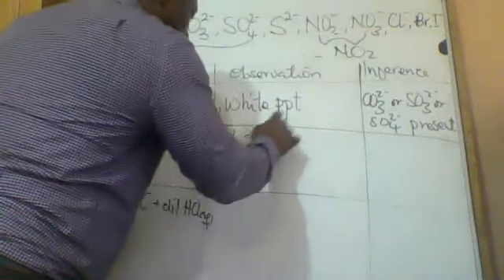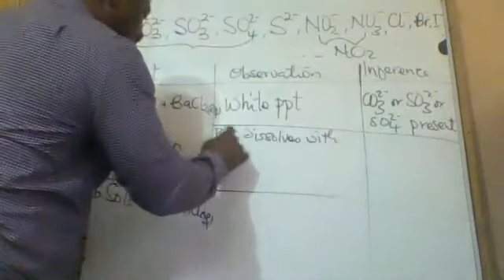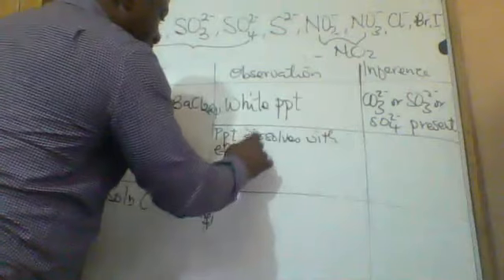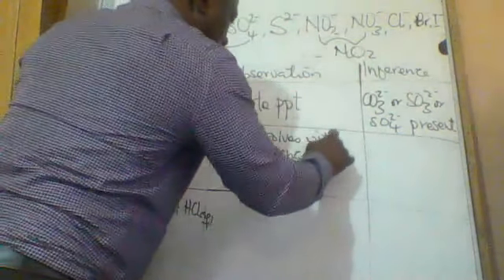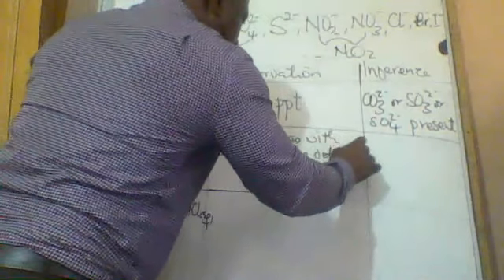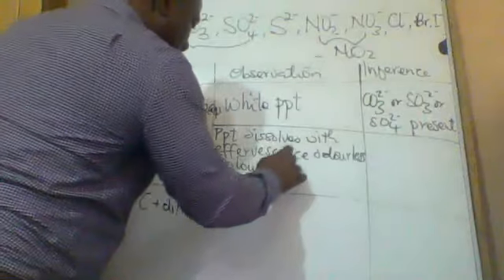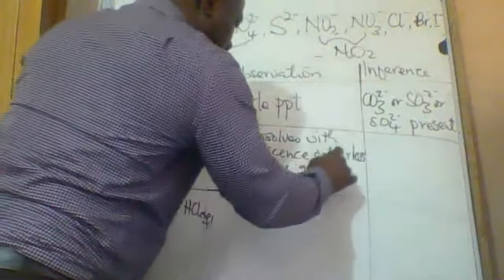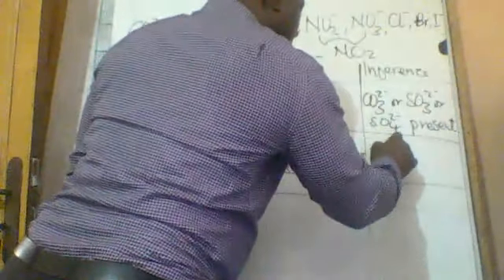PPT dissolves with effervescence, odorless, colorless gas evolved. Then it means that carbonate is present.